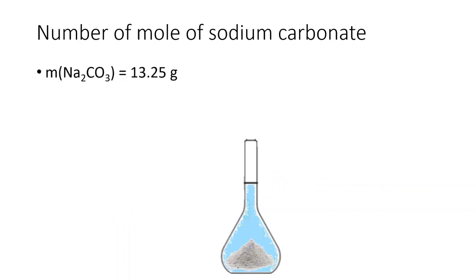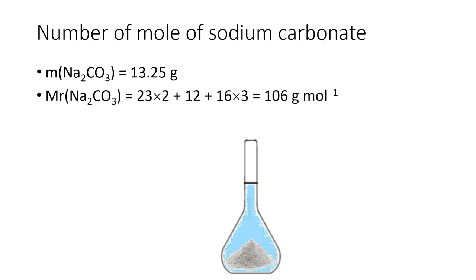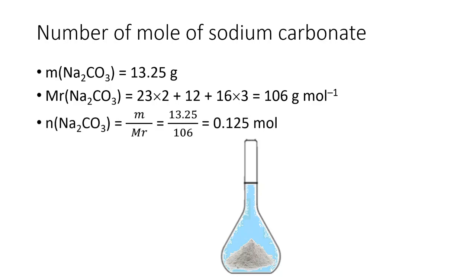Now, the mass of sodium carbonate that I used was 13.25 grams. The relative formula mass of sodium carbonate is 106 grams per mole. So the number of mole of sodium carbonate, where the number of mole equals mass over relative formula mass, is 0.125 mole. And that's how many mole there is in the 250 millilitre solution, in all of that solution.